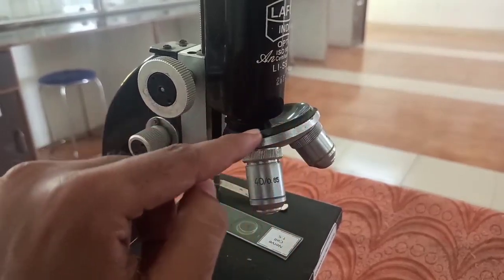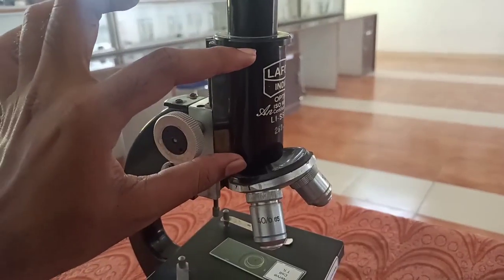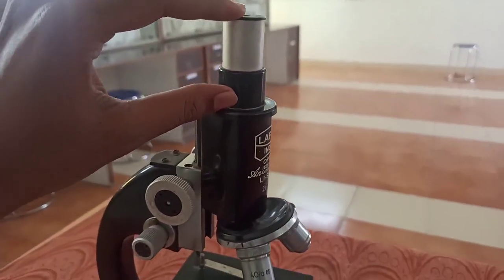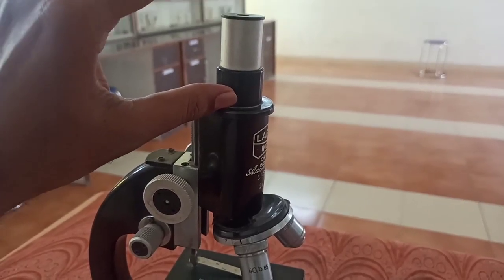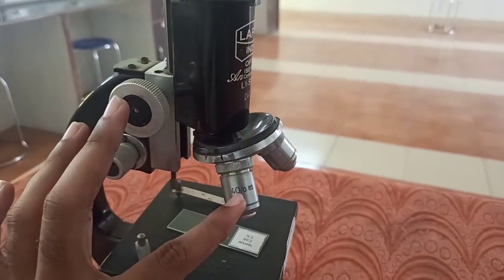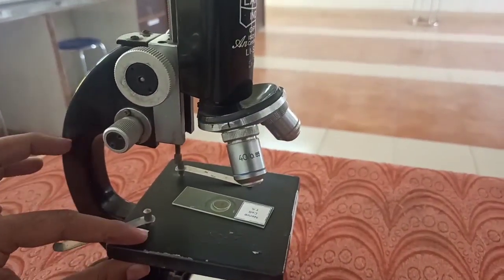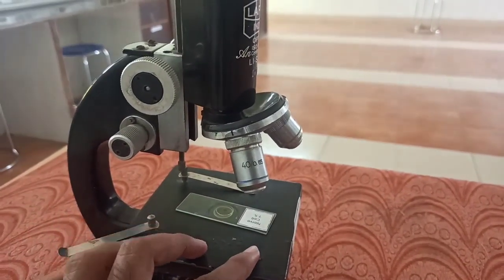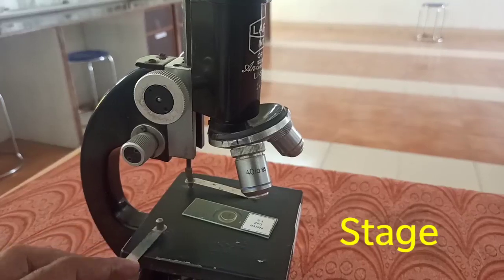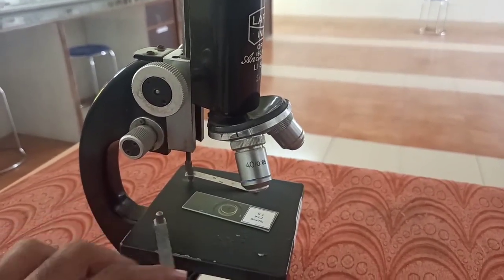The nosepiece holds the objective lenses. Now, this is the stage. This region over which the slide will be placed is called the stage of a microscope. Over the stage, there are some clips — these are called stage clips, or we can say slide clips.